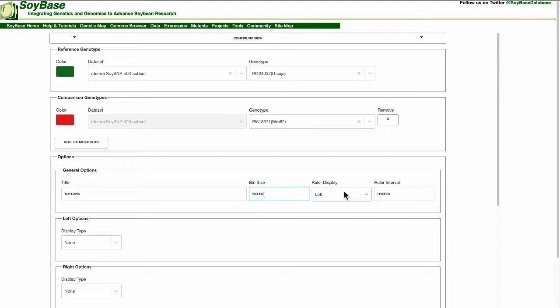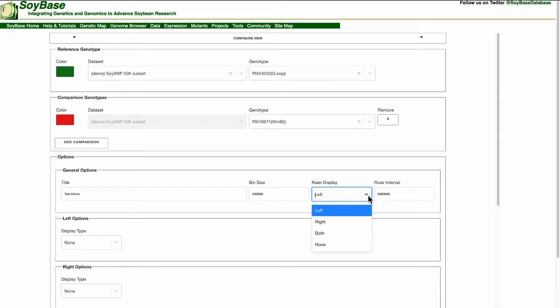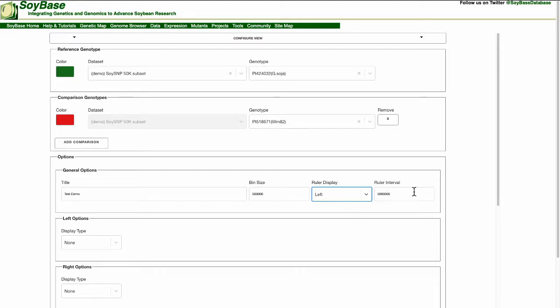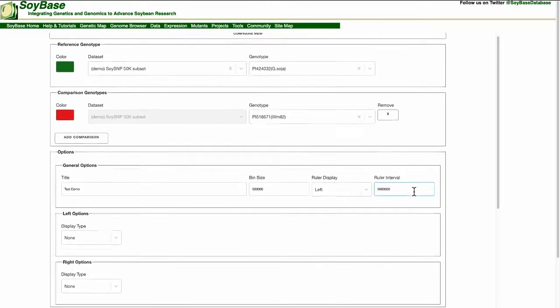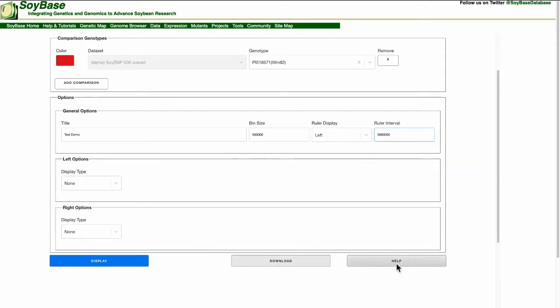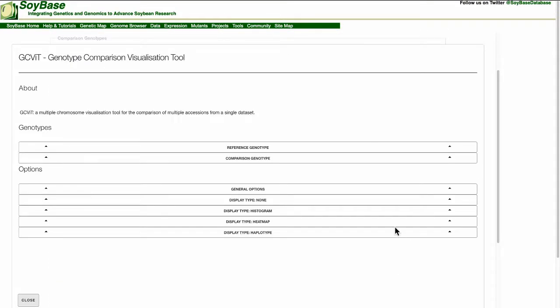Bin size controls the number of base pairs used for the comparisons. Ruler display is where the ruler should be displayed on the picture. This includes the left-hand side, right-hand side, both sides, or no ruler at all. And finally ruler interval is the number of base pairs between major divisions on the ruler. For more information on these options please refer to the help documentation at the bottom of the screen.